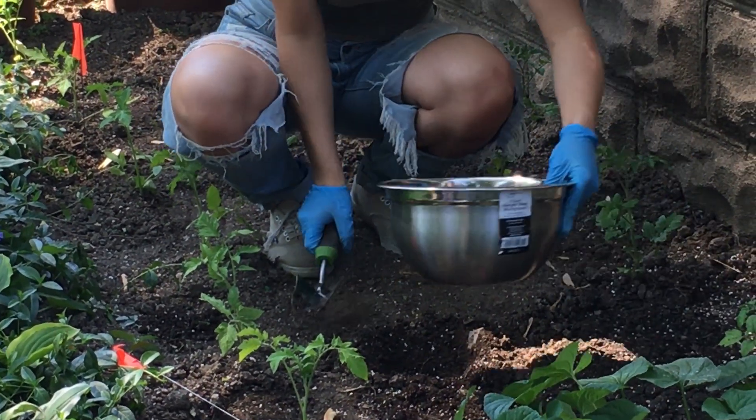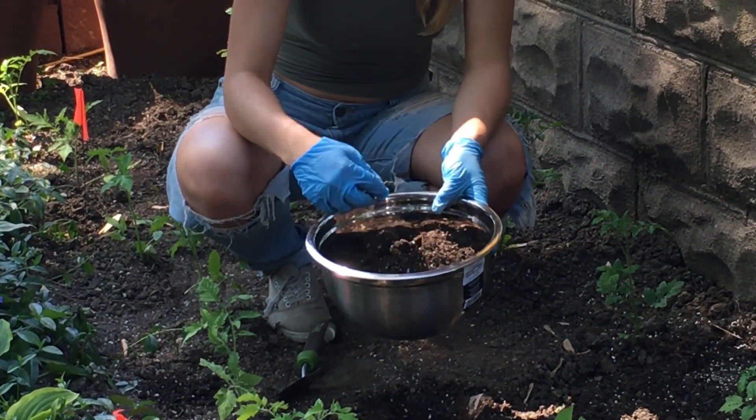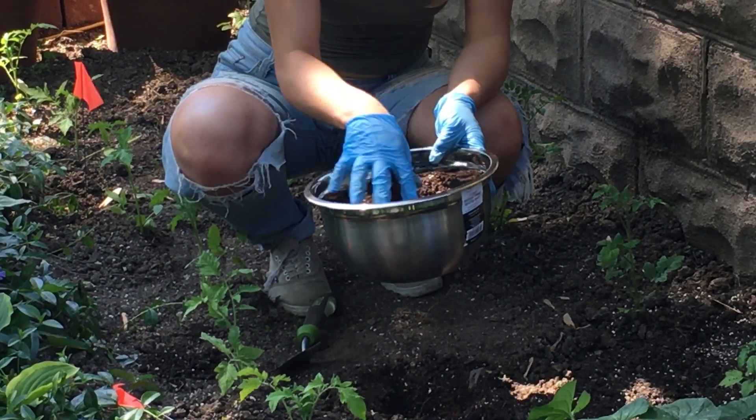Once you take the sample, take all the dirt and make sure there are no sticks, rocks, or worms in there. You also want to break up all the dirt so there are no big clumps.